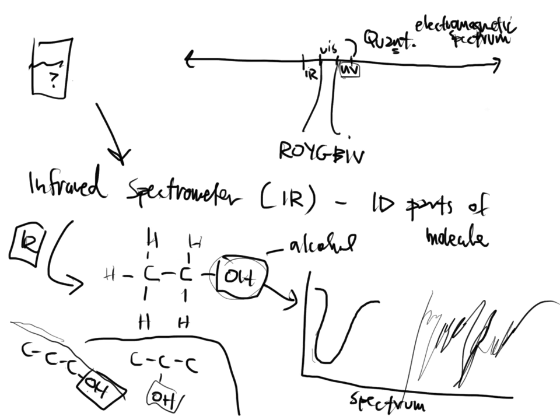Well, because of that, infrared spectroscopy needed some work. We needed to improve it in some form or fashion. We knew that the fingerprints were very unique. We knew that we could analyze samples on them very well. We knew that we could get functional groups to identify with. So we would have clues as to what the molecule is, but we couldn't really identify everything. So they went back and revisited infrared spectroscopy, and they came out with FTIR. And FT means Fourier Transform.